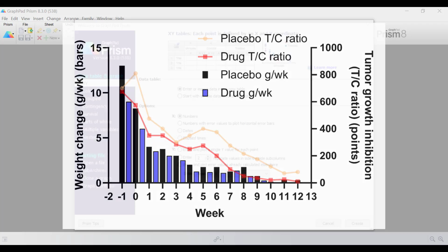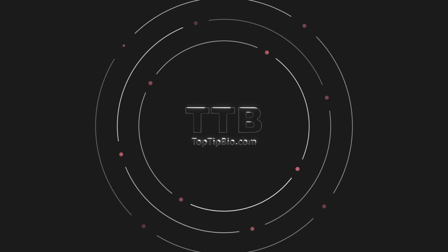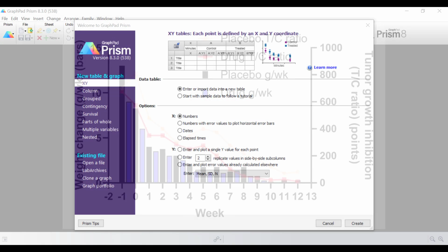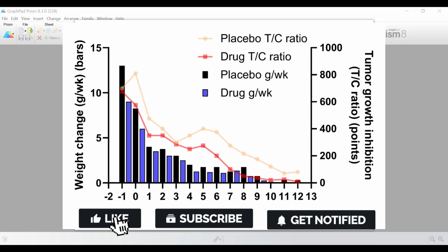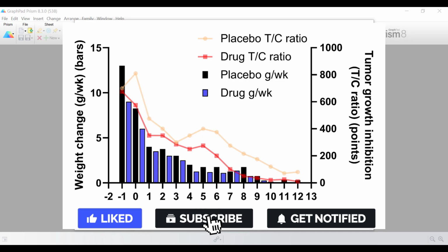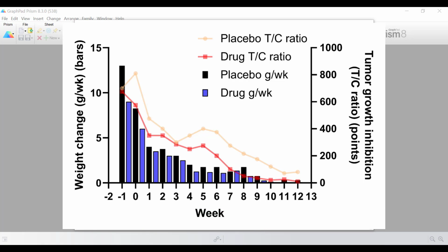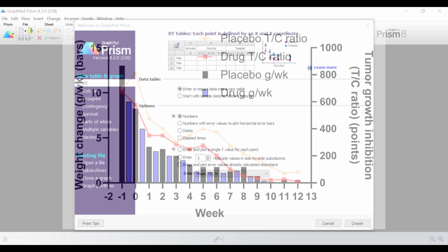In this video tutorial I will show you 3 ways to combine bars and plots onto the same graph. Combining bars and plots is a great way to show multiple data with different measures and scales onto the same graph. In the first example, this is a bar graph with some datasets plotted as points, and these points are connected like a line graph.